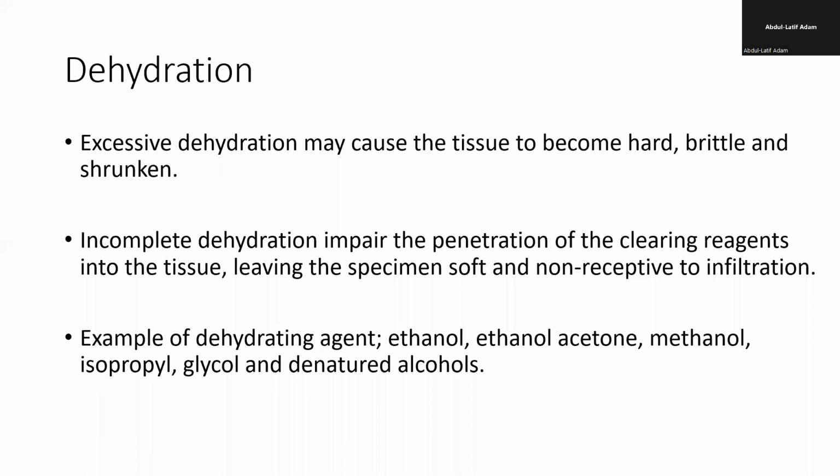Before you can section, you have softness. If dehydration goes on too long, the tissue can become so hard that it becomes brittle and starts fragmenting, breaking into pieces.